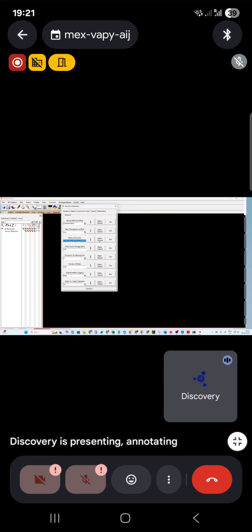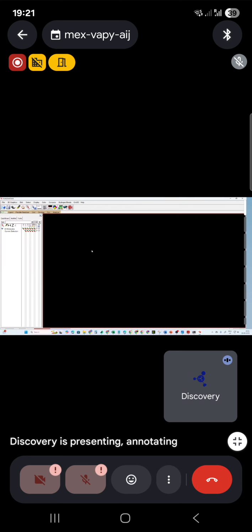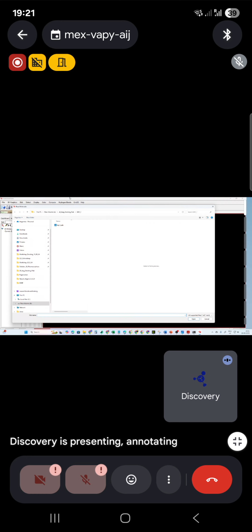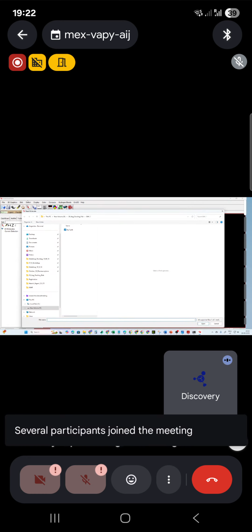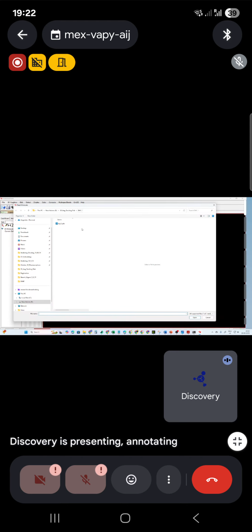And then make this default. Just click the make default button. That's it. And you can just dismiss this window. So now if I open the file, read molecule, it will directly open in my working folder because we have set the path of this particular tool to my working folder. Okay, so all the output files will also be generated in this working folder. So the chances of getting errors later on will be less.